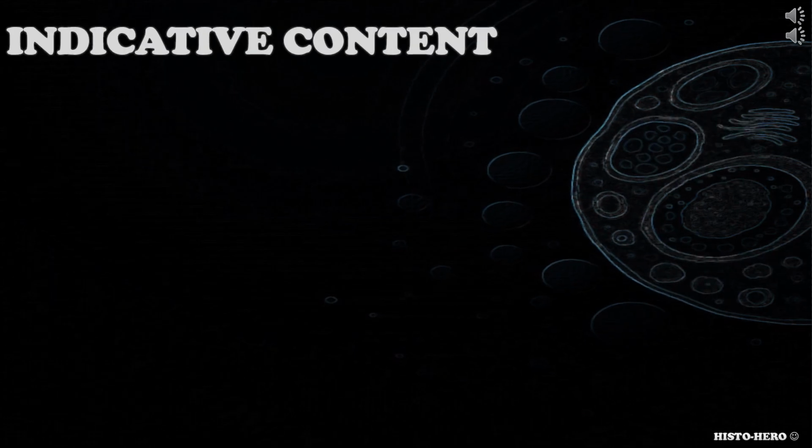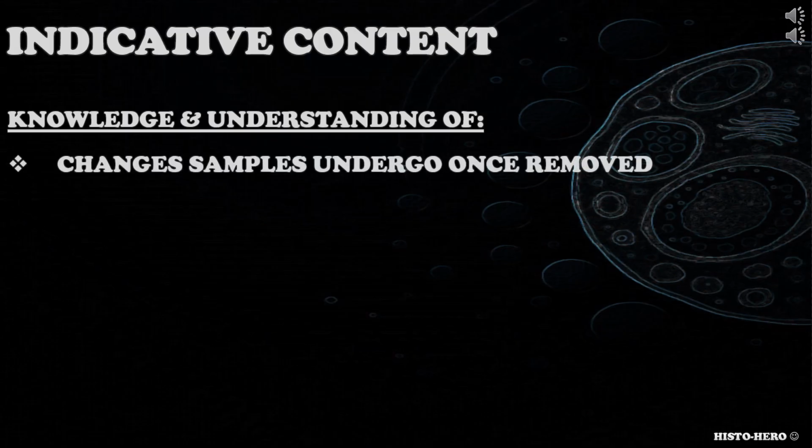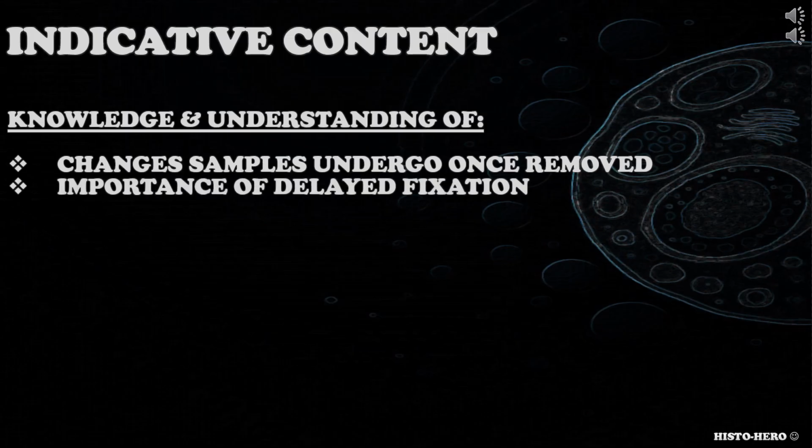Indicative content highlights background knowledge that might be assessed during the viva. They may or may not be demonstrated by the learning outcomes or candidate's evidence. In this submodule, candidate is expected to have the knowledge and understanding relevant to the deterioration and changes samples undergo once removed from the body and how this is minimized, e.g. autolysis, cooling/freezing, fixation. Situations where delayed fixation of samples may be required and why it is important that fixatives are sometimes not immediately used, e.g. frozen section, genetic analysis, biobanking.